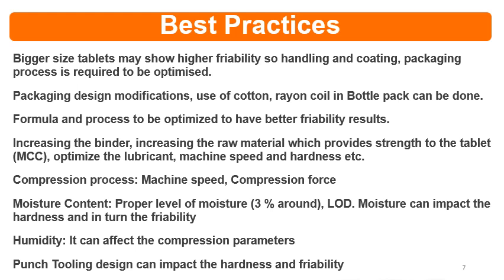Then packaging design modifications, use of cotton, rayon, coil in bottle pack can be done. If you are packaging a formulation like a bilayer tablet, at that time there are chances that layer separation happens due to transport and due to handling. Then formula and process is to be optimized to have better friability results.